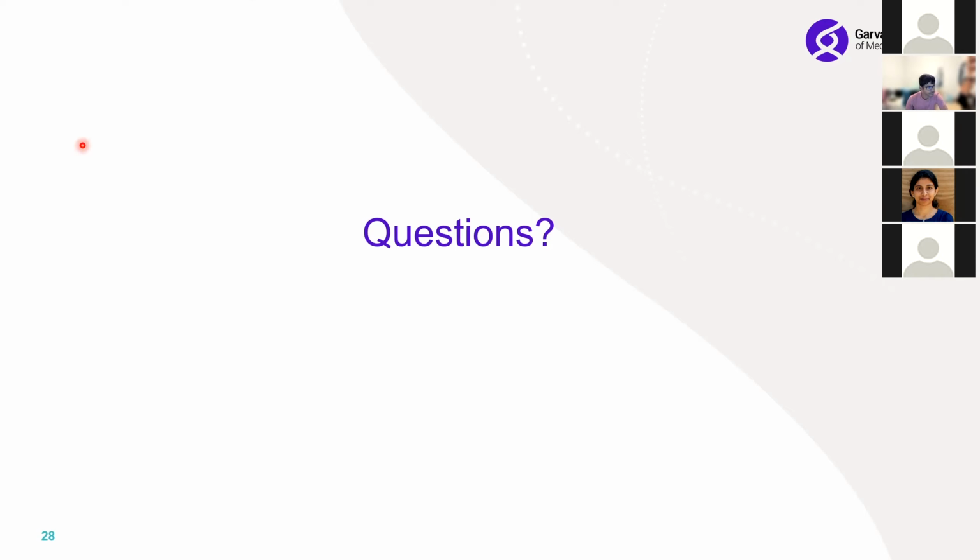I was wondering, you have done some workflows. A lot of the tools that are there in bioinformatics work on so-called short reads, right? Yeah. And nanopore has long reads. Yeah.